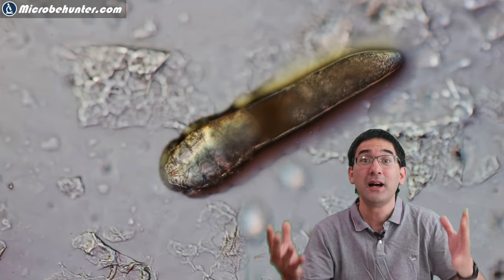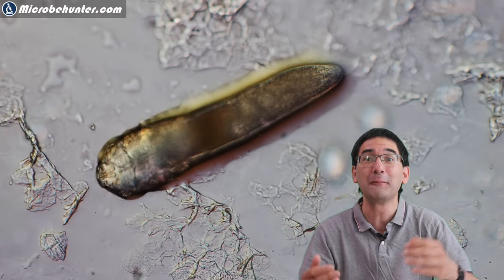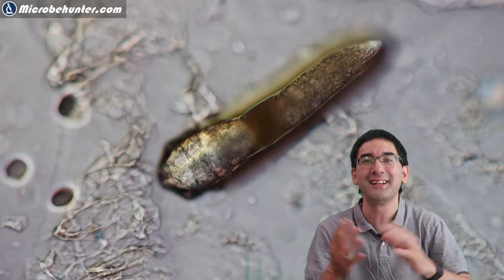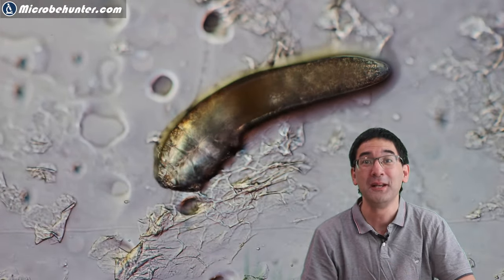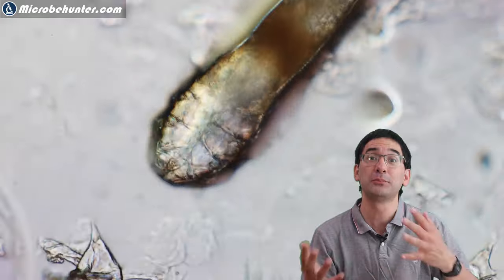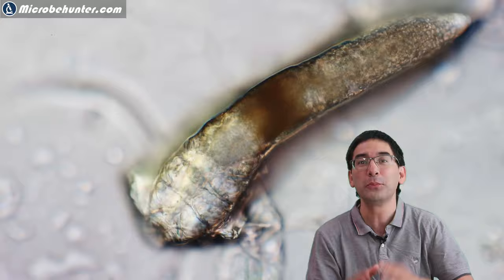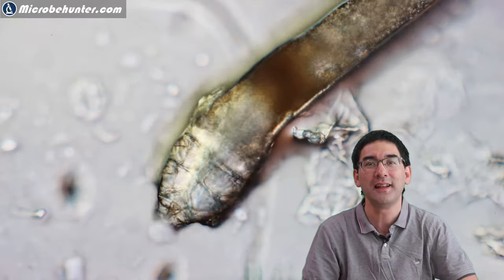In my previous video the face mites did not move around, but today it's a little bit different. I'm going to show you how they crawl around on the microscope slide. The videos are in time-lapse, approximately five times faster than real time, but even under the microscope you can see quite well that they're moving forward with their eight little legs.